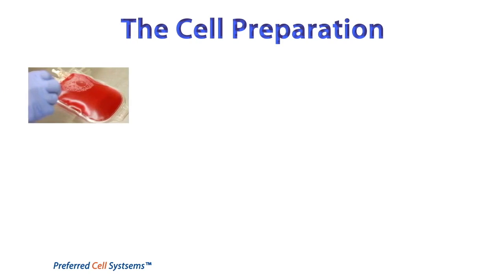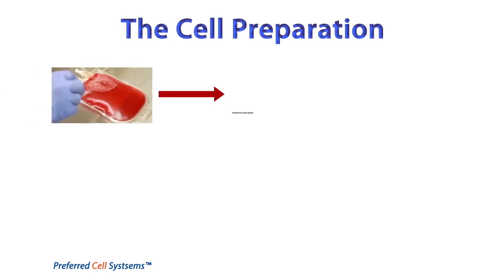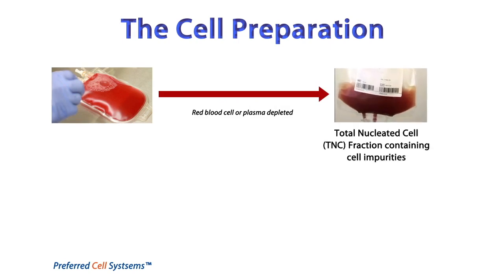Now let's briefly consider the cell preparation itself. Unless you are using an apheresis mobilized peripheral blood preparation, it is generally routine to use a so-called total nucleated cell or TNC preparation. This is a cell preparation that has usually been partially red blood cell or plasma reduced, leaving a large proportion of cell impurities. Although a TNC preparation can be used in Halo SC-IPS, it is strongly discouraged because the large number of cell impurities mask and dilute the very small proportion of primitive stem cells. Although Halo SC-IPS is about 5,000 times more sensitive than any CFU assay, the low response for both primitive stem cell populations will not provide a reliable and reproducible measure of stem cell quality or potency.